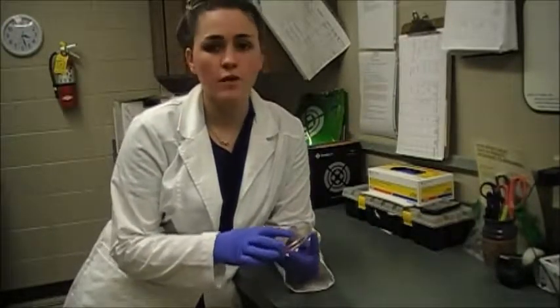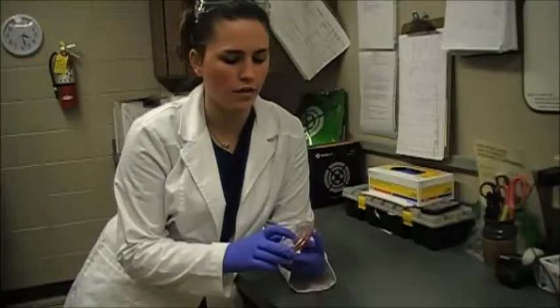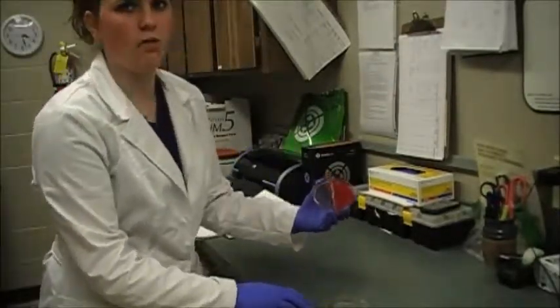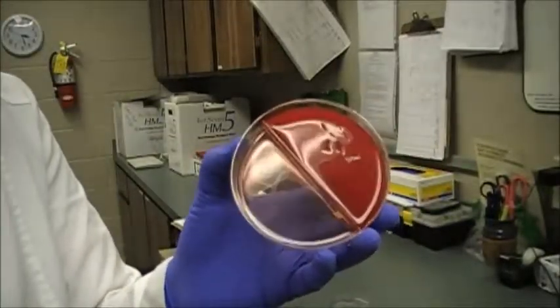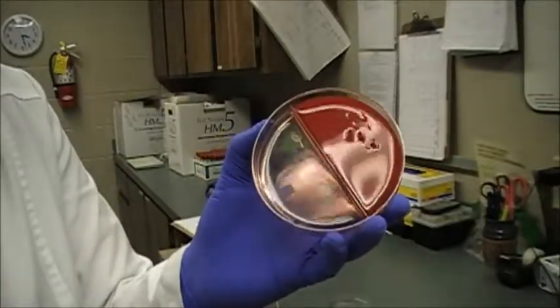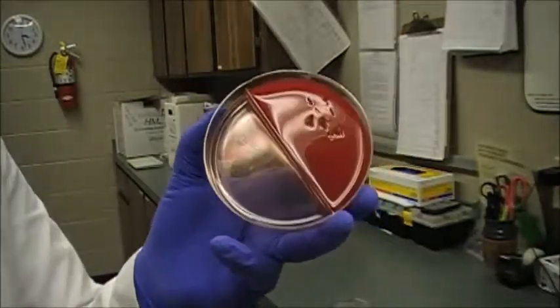So I have right here our dermatophyte testing medium, or our DTM. It's been incubating now for several days as required according to the manufacturer's directions for this medium. So we can go ahead and look at our results now — it's been incubating at room temperature. When we're looking at this agar, we can see the sample that we put in there, but there has been no bacterial or any kind of growth in this culture. That indicates that this is a negative dermatophyte test.